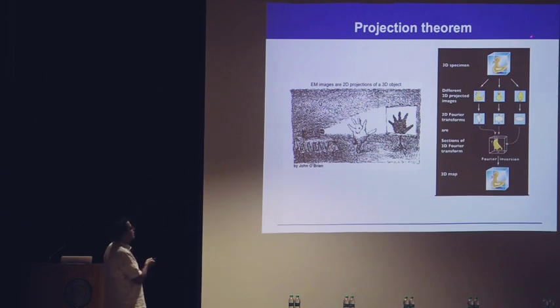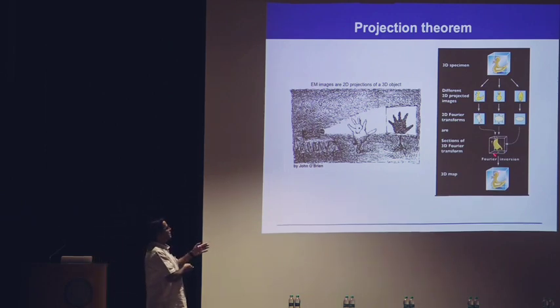Suppose you have a 3D duck, right? You put that duck in a microscope, but don't actually put a duck in a microscope. Okay, and what will you get? You get 2D projections of that duck in different orientations, and you do a Fourier transformation. In Fourier transformation, the projection becomes a slice. And you have a 3D duck, that is your model, the initial model, and you computationally make its 3D Fourier transformation.